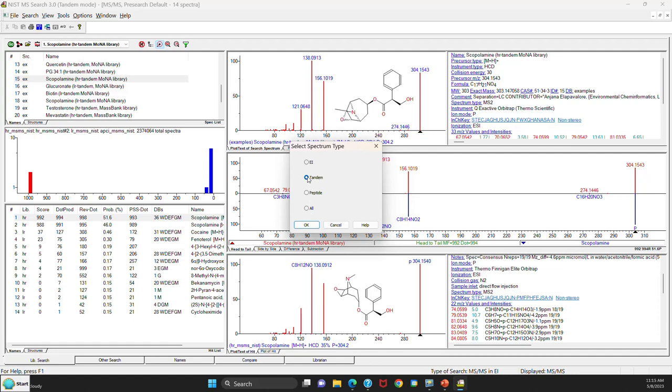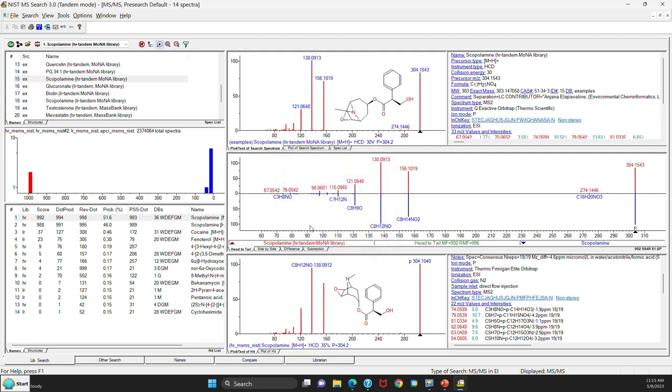So since we're interested in tandem, we'll pick tandem, say OK.